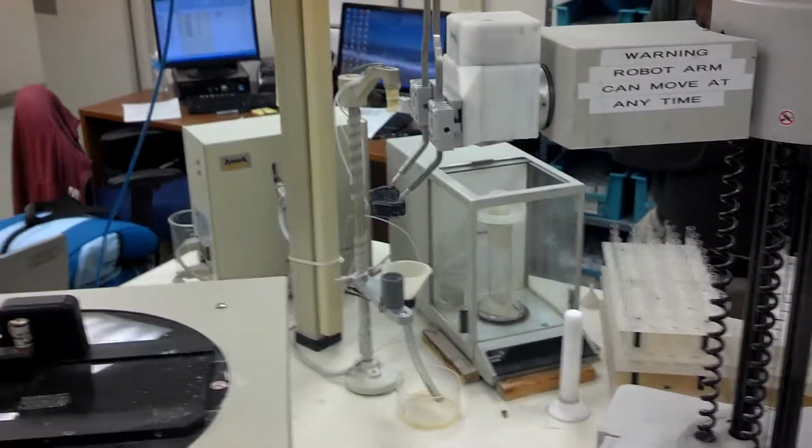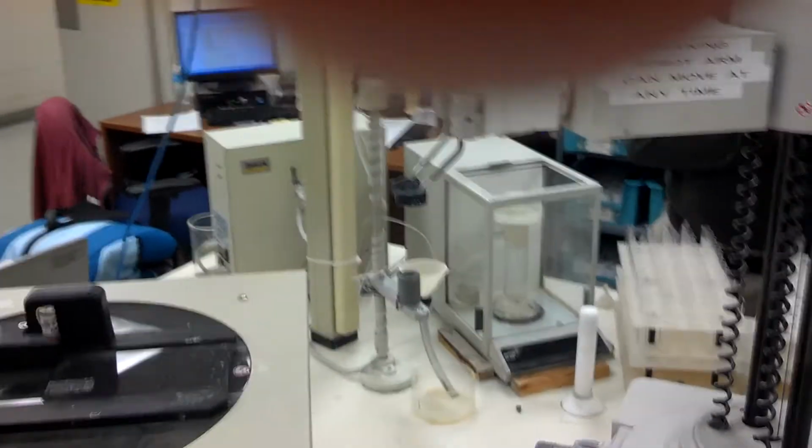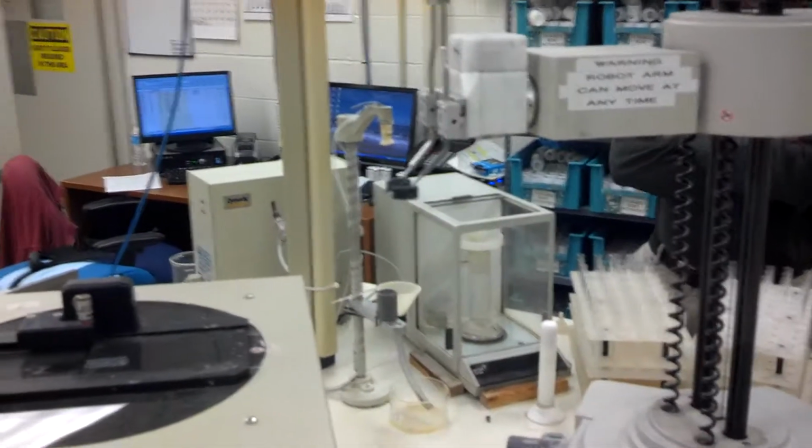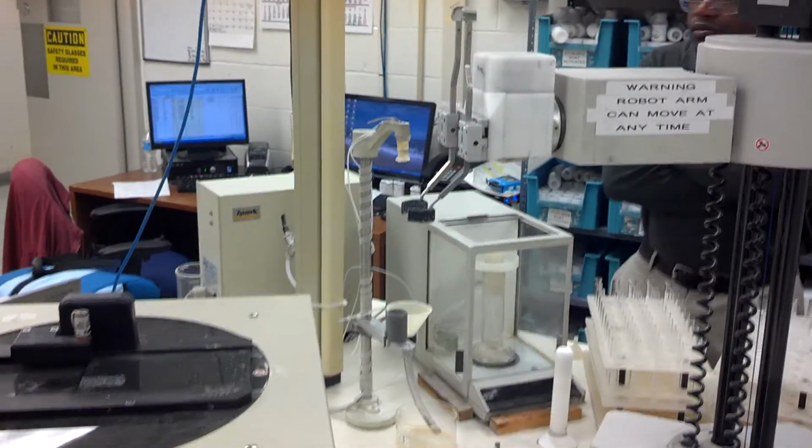No, not that, but the one side. It brought one out of the centrifuge and it just parked it here. That's probably a balance. Is that the weight? Oh, that was a balance. Okay, that was a balance too. Okay, yeah, because you're going to have to put... But I didn't see it weigh the first one though. That was the thing. I didn't see it either.